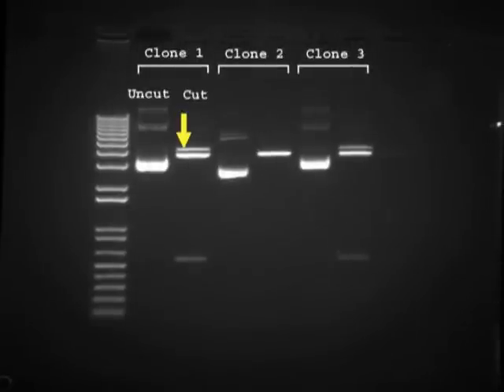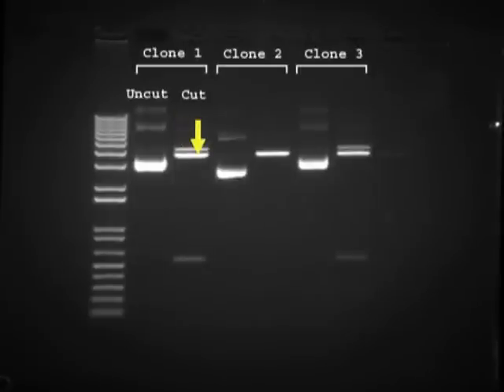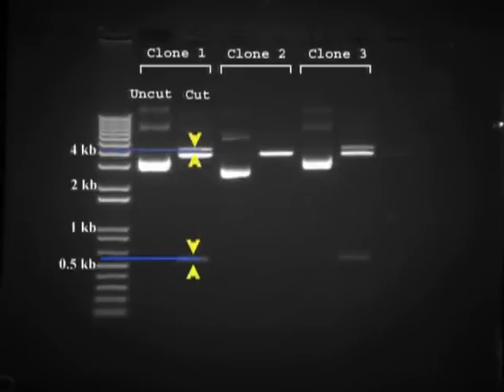One for linearized vector, one for vector without insert, and one for the insert itself. Also, this gel allows us to verify the size of the linearized vector and of the insert. The bottom line here is that both clones 1 and 3 contain inserts, and the inserts are of correct size.